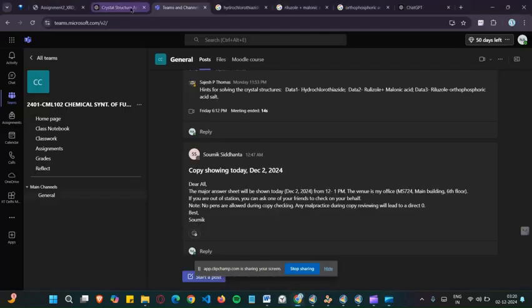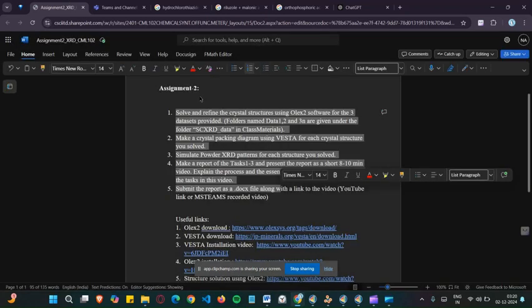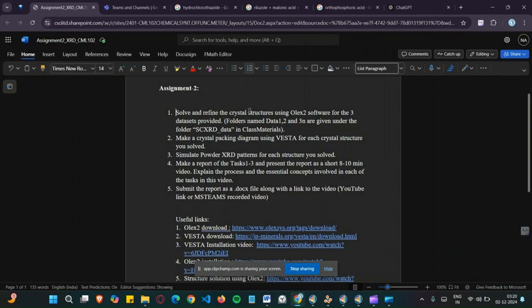Hi all, so this is a video regarding the second assignment, assignment 2 of CML102. So we are given the following tasks. The first one says we are required to solve and refine the crystal structure using Olex2 software for the three datasets provided. They are the SCXRD data.